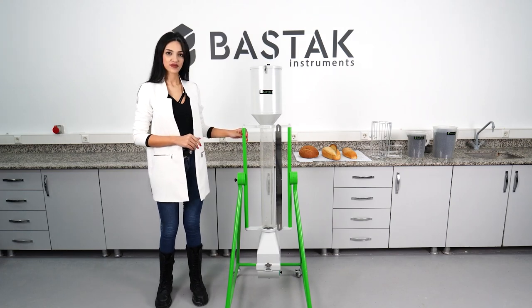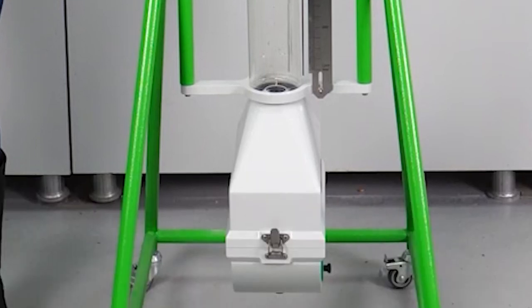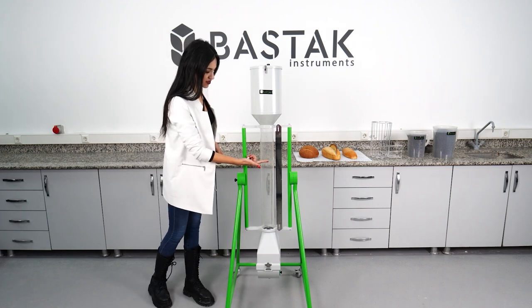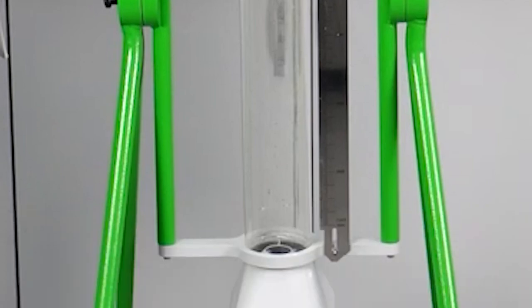The support skeleton system is used to safely support the components, elements, or loads for movement within the system. The first sample chamber is where samples of baguettes and long loaves of bread are placed. The transparent transfer tube is the tube that enables the displacement of seeds determining the bread volume during measurement.